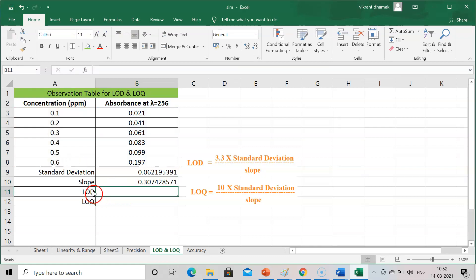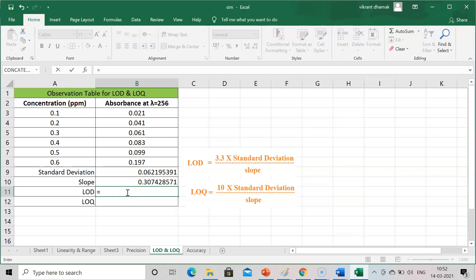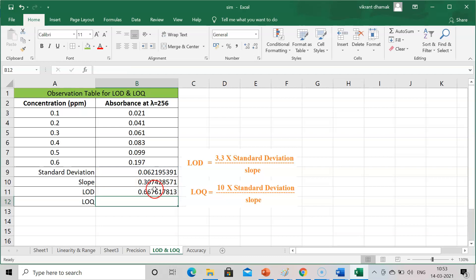After that, LOD. The formula for LOD is 3.3 into standard deviation divided by slope. We have these values for standard deviation and slope. And for LOQ, 10 into standard deviation divided by slope. Now we will set the formula. Press equal to, press bracket, 3.3, and standard deviation. Press the star and then select the standard deviation cell. After that, complete the bracket divided by slope. You will get the value.